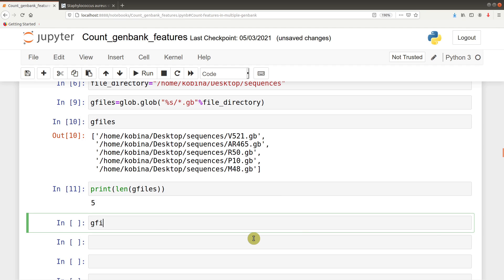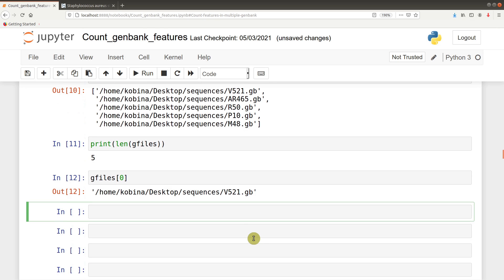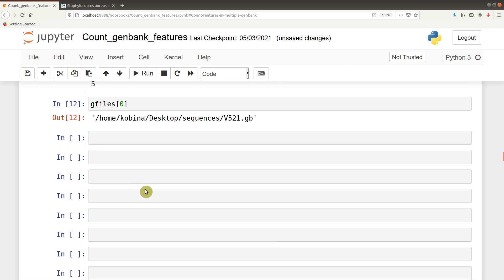You could also query for just one of them — for example, the first member. Now, because we are dealing with multiple GenBank files, we need to have a way of automating the code. We are using similar code just as we did with the first video on how to find and count features in a single GenBank file. It's the same code that will be used, but we have to automate it so that it can run on multiple GenBank files. And that's where Python comes in.